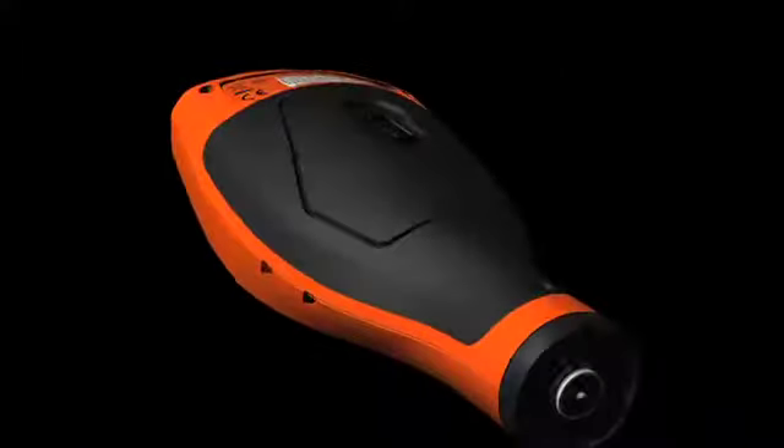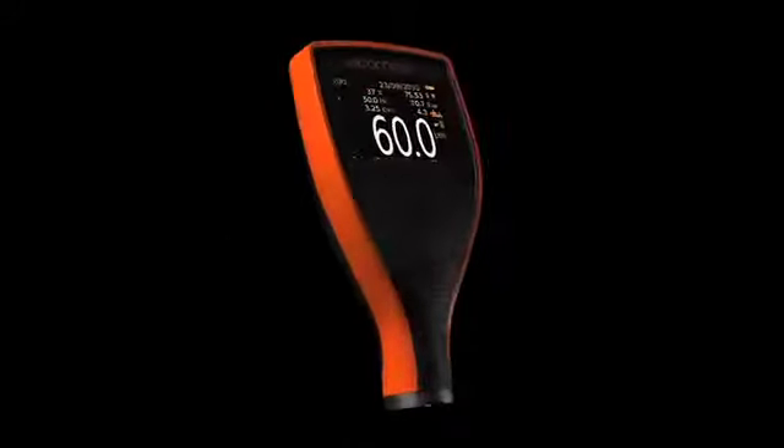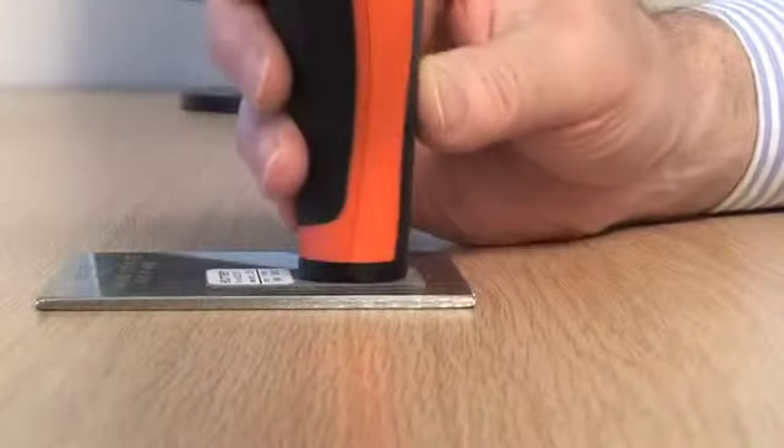The new Elcometer 456 is more powerful, rugged and easier to use than ever before. Housed in a heavy duty impact resistant dust and waterproof case, the Elcometer 456 range can be used in the laboratory, the production line or in the harshest of environments.